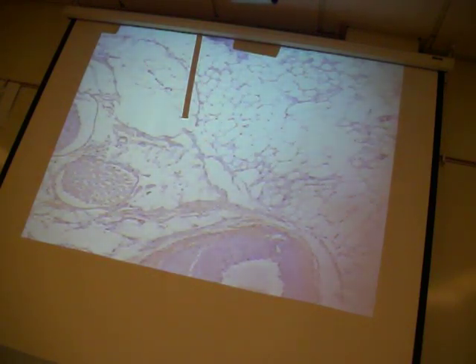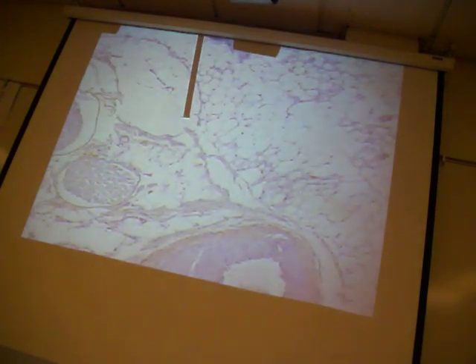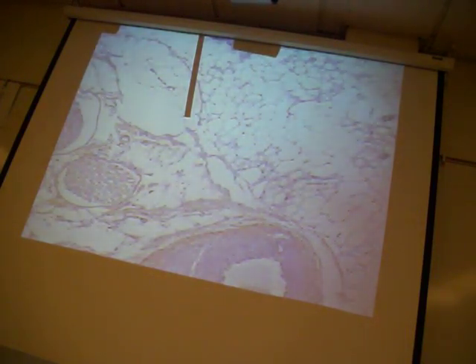But there are other things on there. Okay? And so it's go fish. Okay? So the nice thing about today is, you know, you can Google. That's the greatest thing about technology, that you've got it right there at your fingertip. You can Google an image so that you know what you're actually looking at.